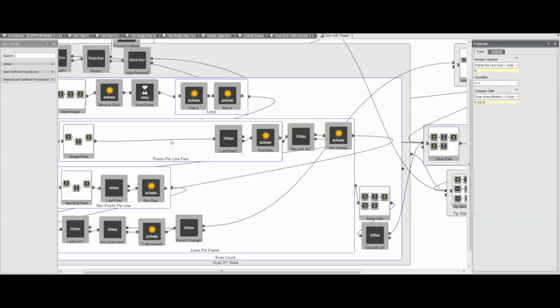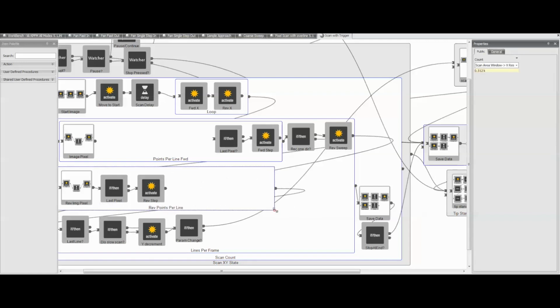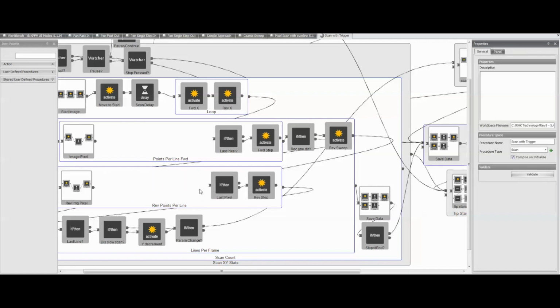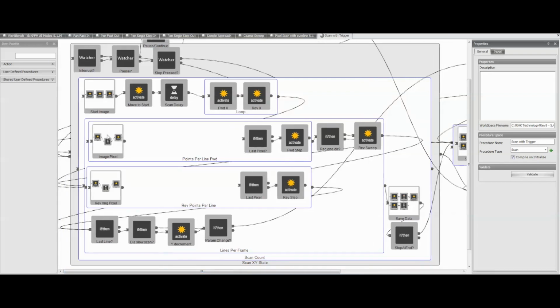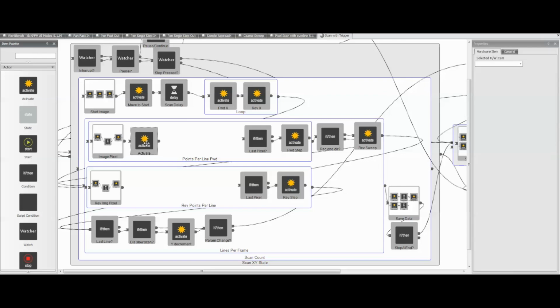Okay, so everything we're going to add is going to be here, and also here. So after we've sampled the image pixel, we want to have a pulse coming from DAC1. We'll call this DAC1 up. We'll select DAC1 from the list.